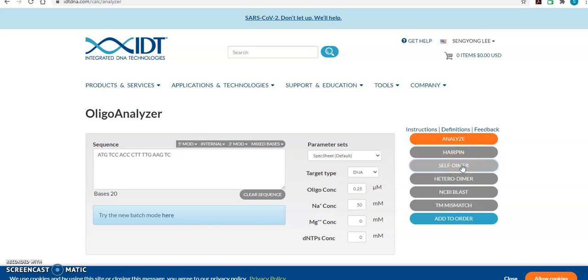Then between those two primers, what are the possible heterodimers you can form. So you have to do the analysis of each primer thoroughly and copy and paste it all into your Word file, and at the end you will do the heterodimer analysis between those two primers. So that's the assignment you need to do.